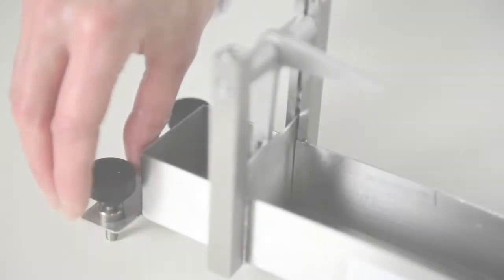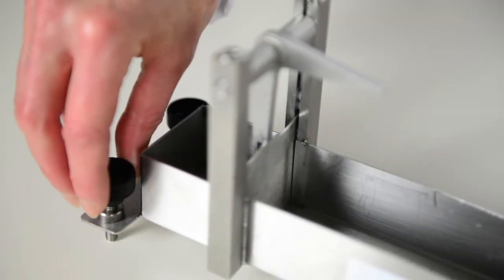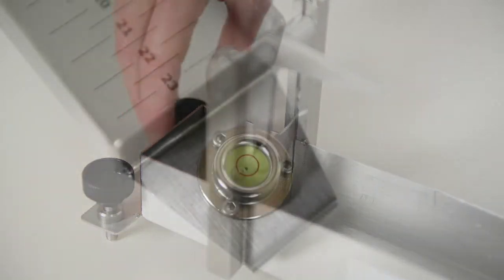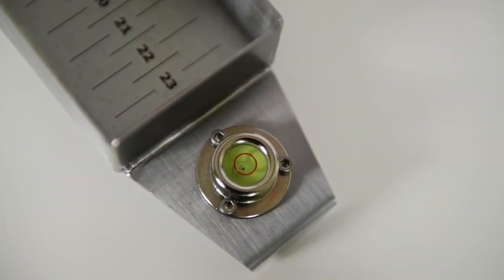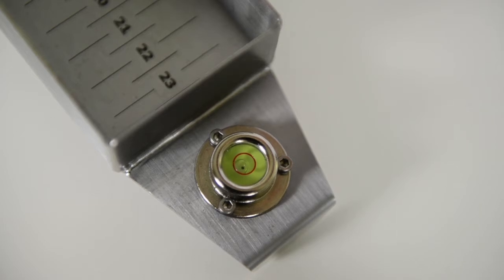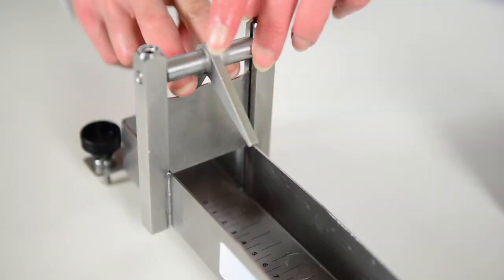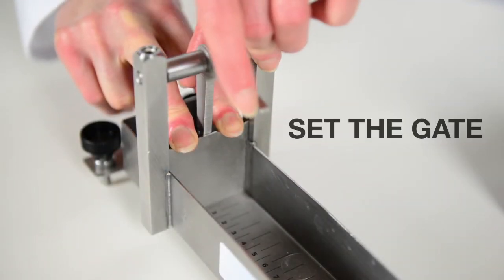First we need to make sure the consistometer is level. Before we start the test we need to make sure our samples are at a constant temperature, for example 20 degrees centigrade. Make sure the gate is down and locked.